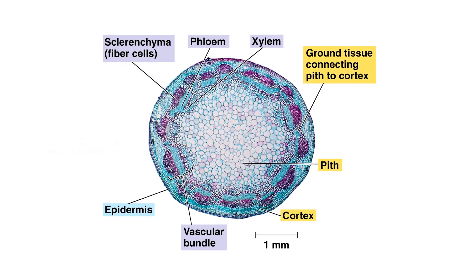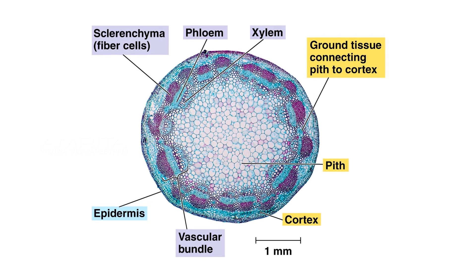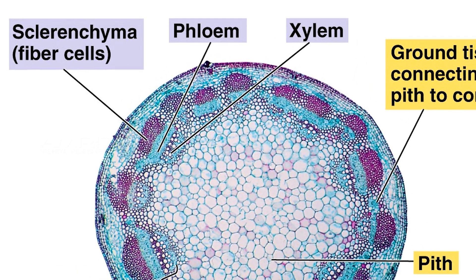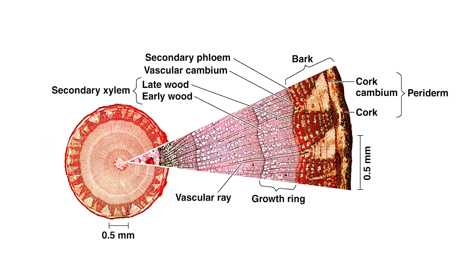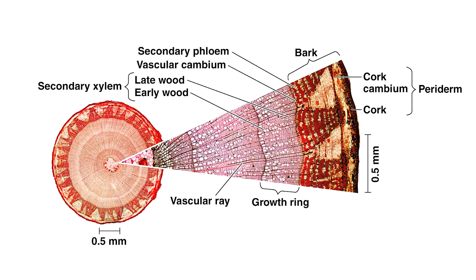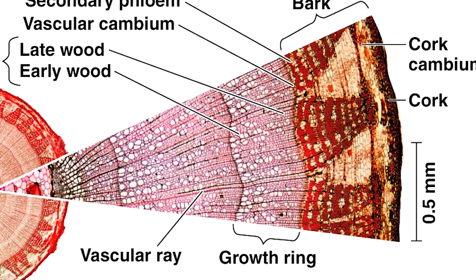In the top part of the stem, where the only sclerenchyma cells present are the xylem vessel elements, lignin staining is only seen in the xylem. In the middle part of the stem, another type of sclerenchyma cells, the interfascicular fibers, is present in addition to xylem cells. Here, lignin is seen in both interfascicular fibers and xylem cells.